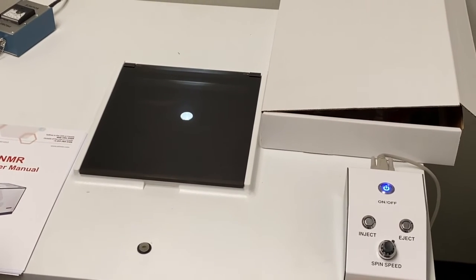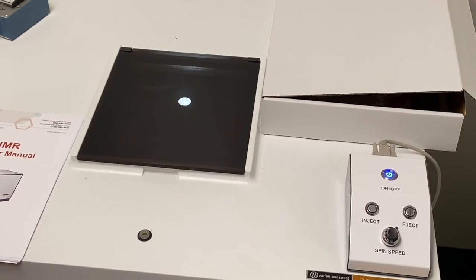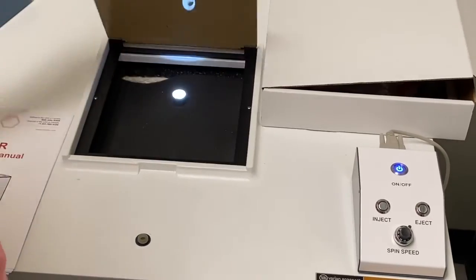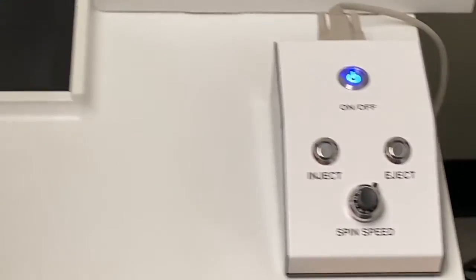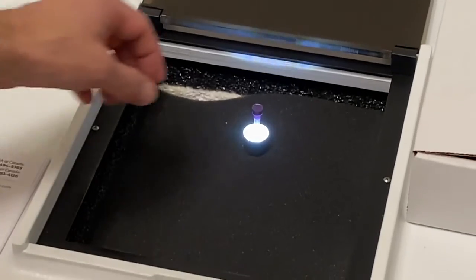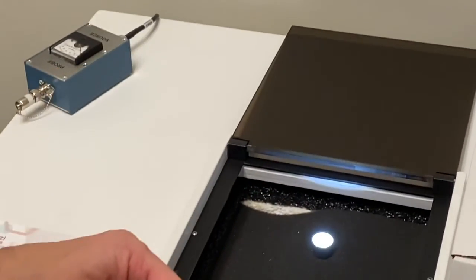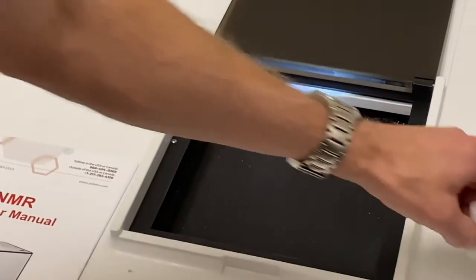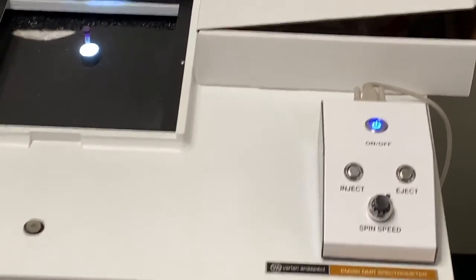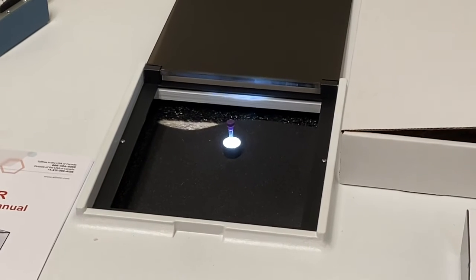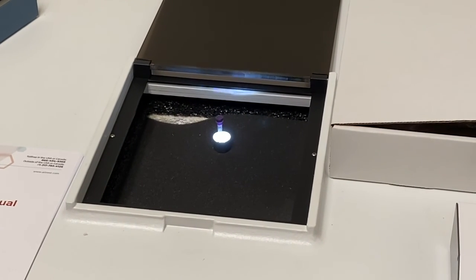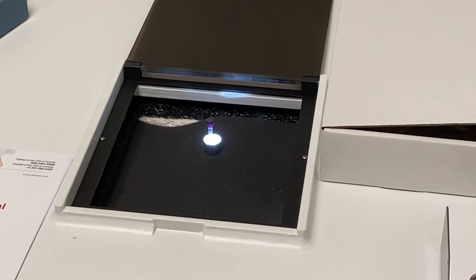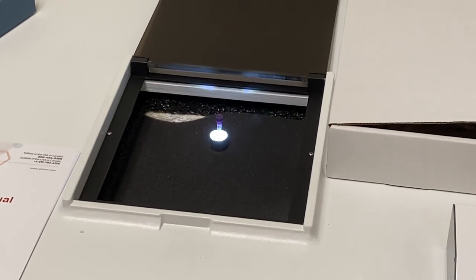Once you're done and you're satisfied that it printed and looks good, it's time to eject the sample. Open up the lid, come over to the button that says eject, hit it, and your sample pops out. You can take it out. Make sure you leave the spinner in the room when you leave. Don't run off with it. At this point, you're ready to go back, dump the contents of the tube in the waste, clean your tube with acetone, and leave it open to dry for the next NMR.